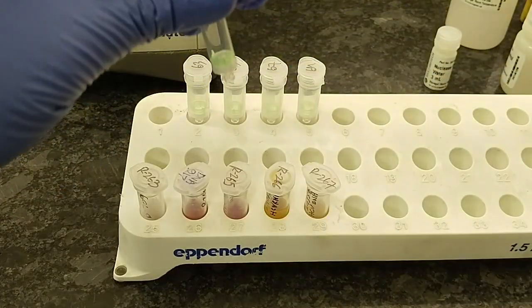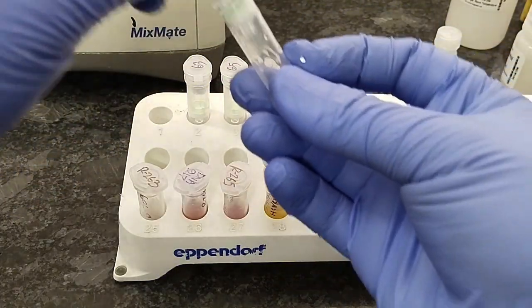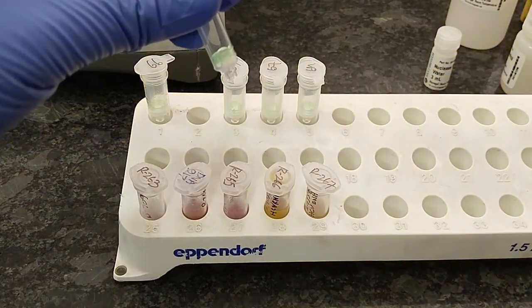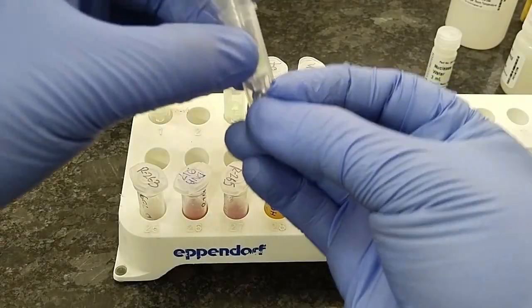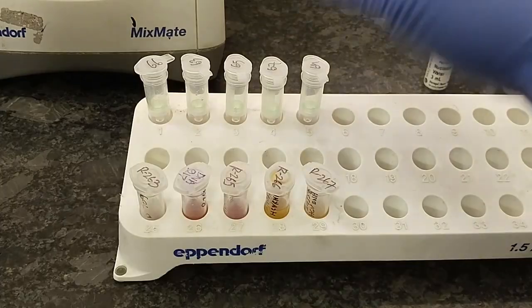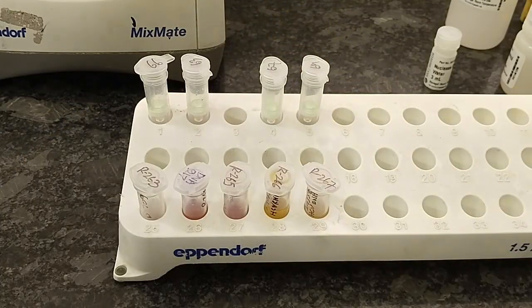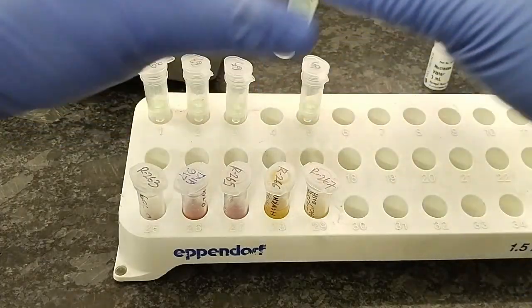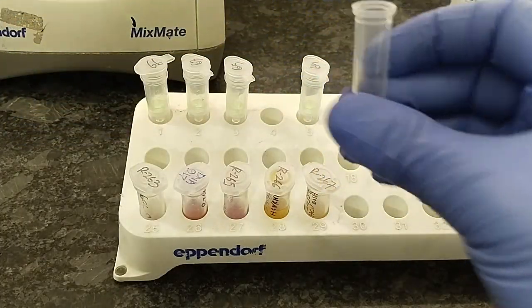Now discard the wash buffer and put it back. Do not discard the collection tube. You have to attach the collection tube with the binding column. Discard all the wash buffer and repeat the step for the second time.